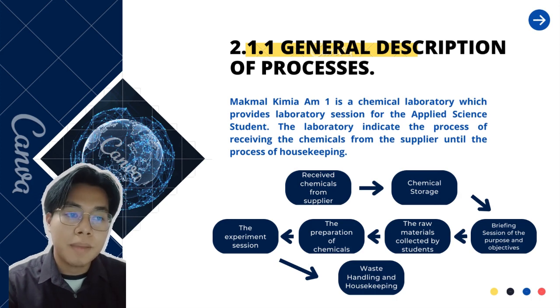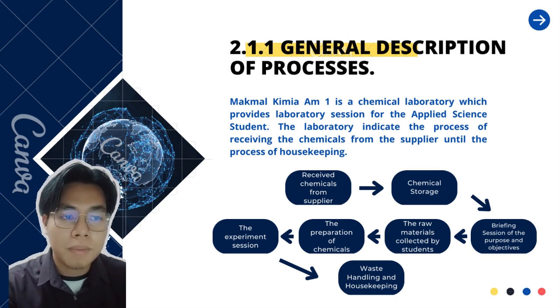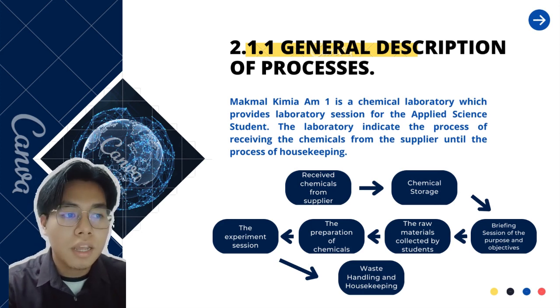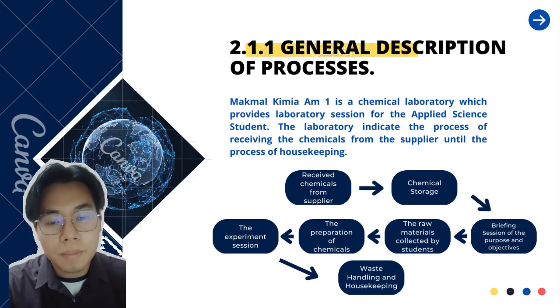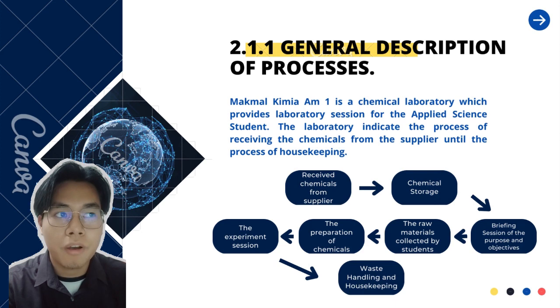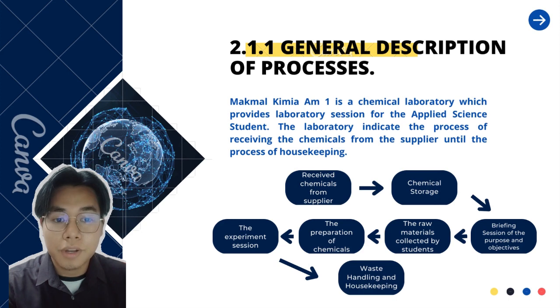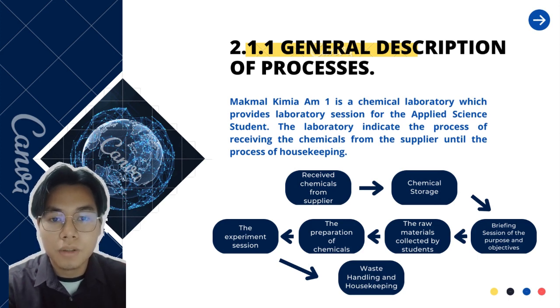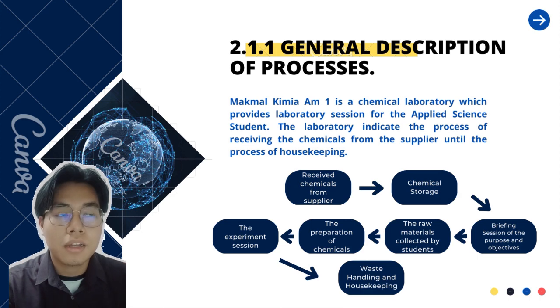From that, the laboratory assistant will conduct the chemical storage process. Next, the briefing session for the students within the laboratory session will be conducted by the lecturer or the laboratory assistant to give them the purpose and objective of the experiments that will be done on that day. Next, the raw chemicals will be collected by the students. Next, the preparation of the chemicals. Next, the experiment session conducted by the students. And last but not least, the waste handling and housekeeping session, which will be conducted by the laboratory assistant with assistance from the students.